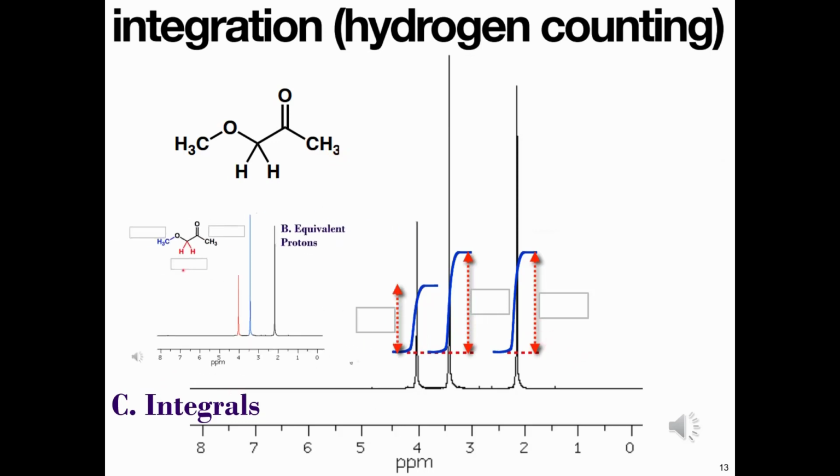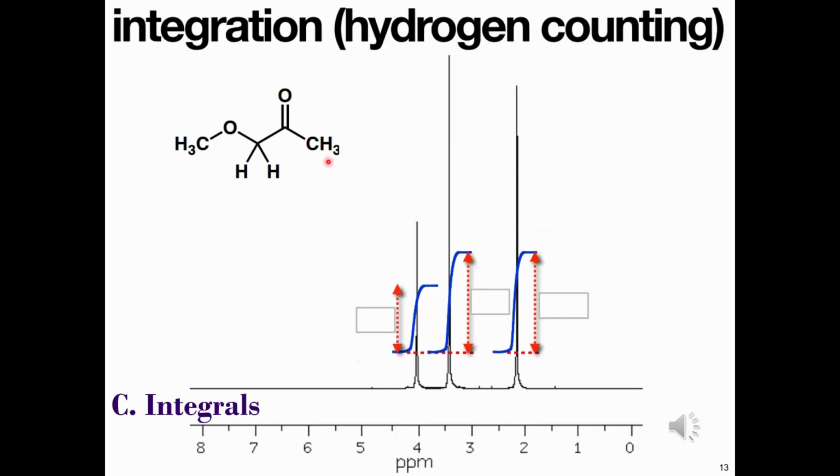So here's that same molecule again from the end of video 2. The methyl ketone protons are responsible for the signal that you see at 2.15 ppm. And the area underneath this signal is measured using a process known as integration. Thankfully, this is done by computers when the NMR spectrum is processed, and the area underneath this peak is 3 protons, which is exactly the same as the number of hydrogens as there are in that methyl ketone.